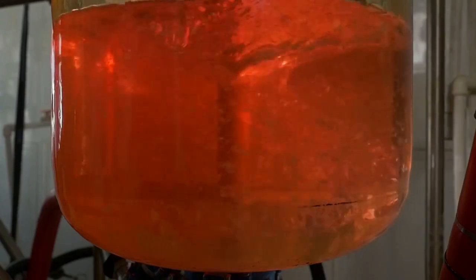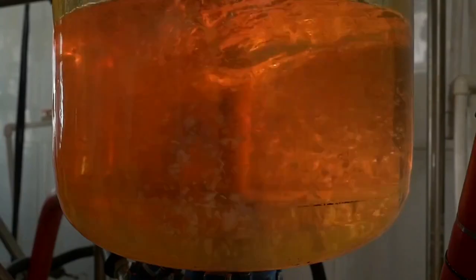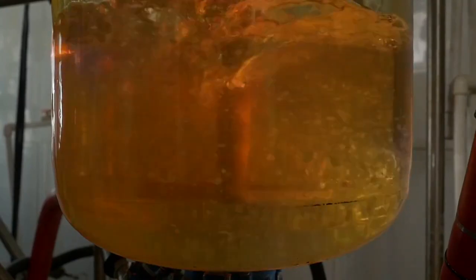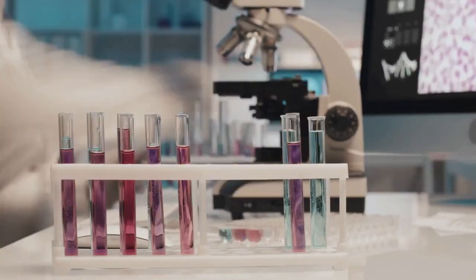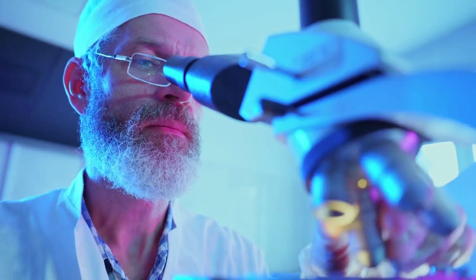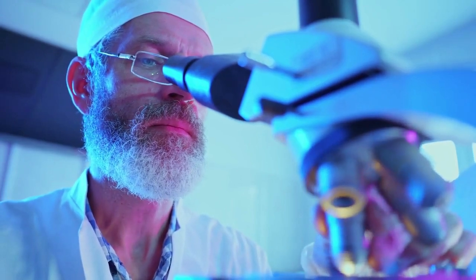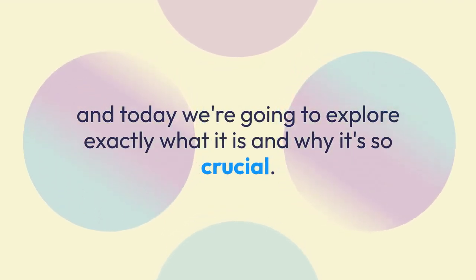Have you ever encountered a problem that seemed impossible to solve until you found a clever workaround? In the world of chemical analysis, scientists face this all the time, especially with a technique called gas chromatography, or GC. GC is fantastic for analyzing substances, but only if they can be turned into a gas easily. So, what do you do with molecules that refuse to cooperate? That's where a powerful chemical trick called derivatization comes into play, and today we're going to explore exactly what it is and why it's so crucial.